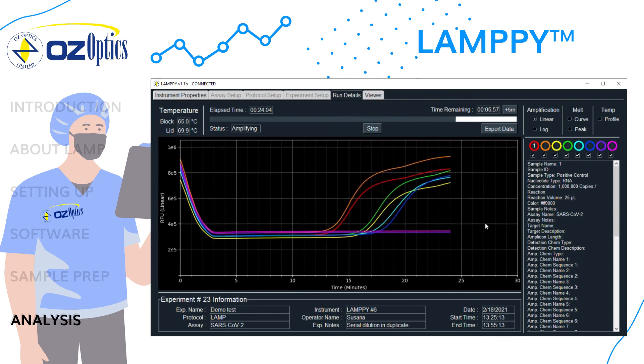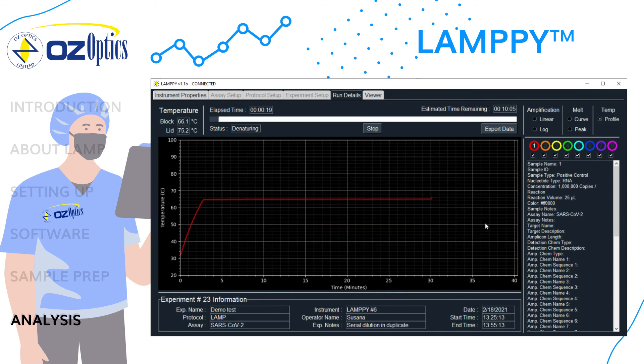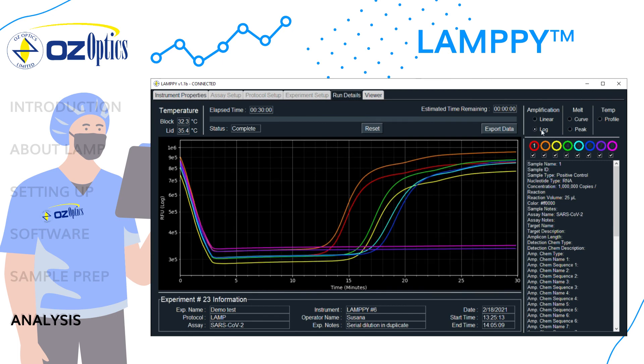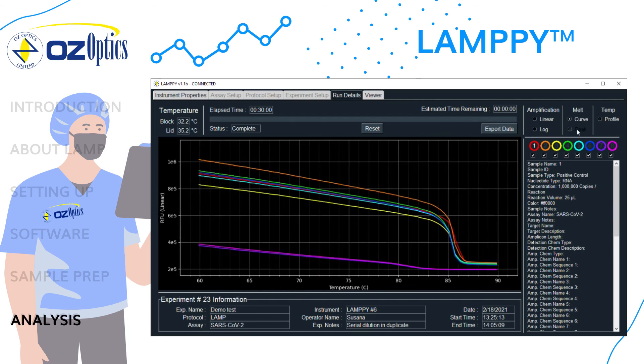During amplification, the linear curve will be displayed. You can also choose to view the log curve. After amplification, and if melt was enabled, the temperature profile will be displayed during the denaturing step. When melt begins, the melt peak will be displayed or you can select the melt curve manually. Once the run is complete, the instrument status will show complete and the reset button will need to be selected before a new run can start. It is best to export the data at this time. The file can be saved as a JSON, CSV, XML, or PNG file.